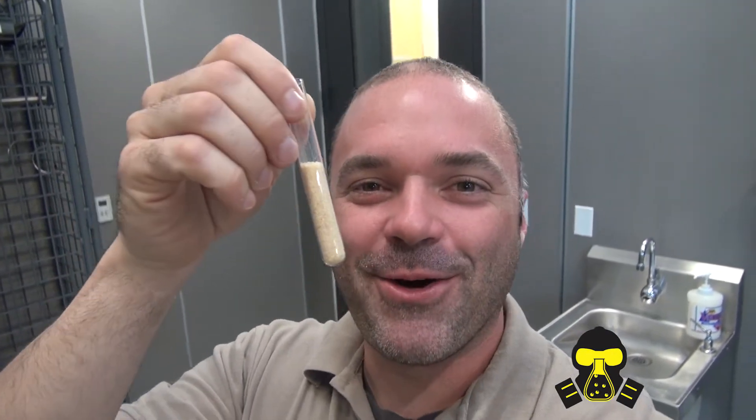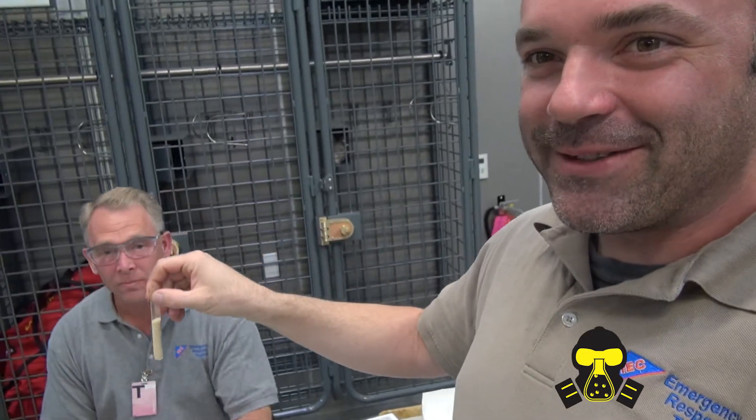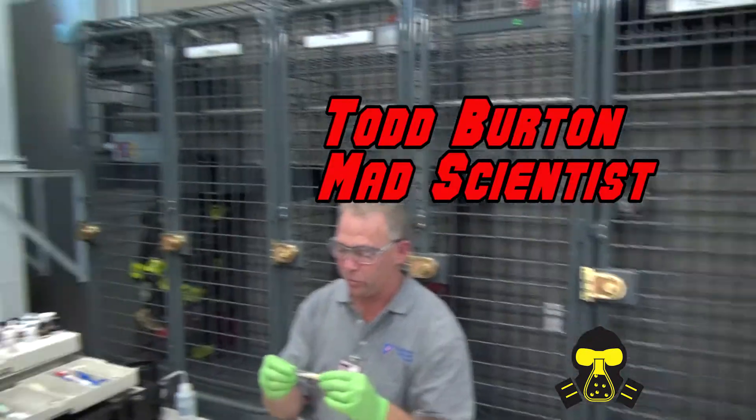Hey guys, Bobby from The Hazmat Guys here once again. We're going to do race-pace solid identification with this little bit of anthrax that I got live — no, I'm joking, it is not anthrax. It is an unknown. I'm handing it over to Todd. Let's figure it out.